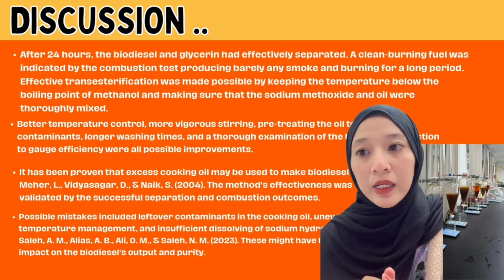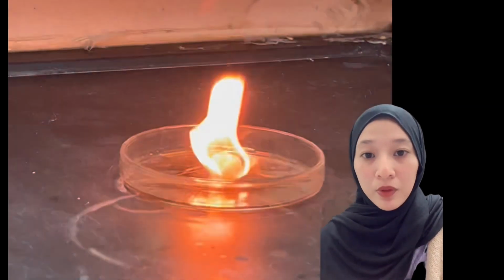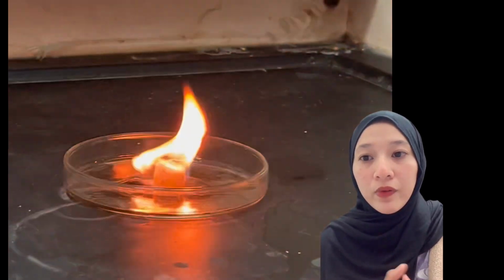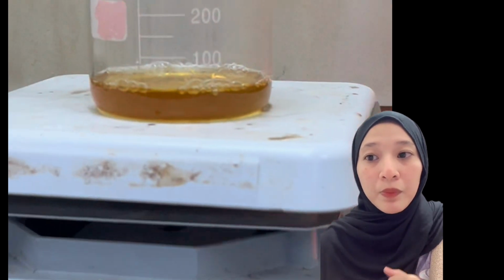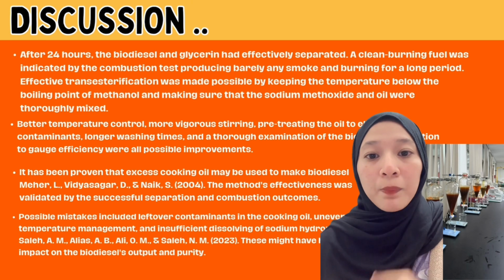And then a clean burning fuel was indicated by the combustion test producing barely any smoke and burning for a long period of time. Effective trans-esterification was made possible by keeping the temperature below the boiling point of methanol and making sure that the sodium methoxide and the oil were completely mixed.